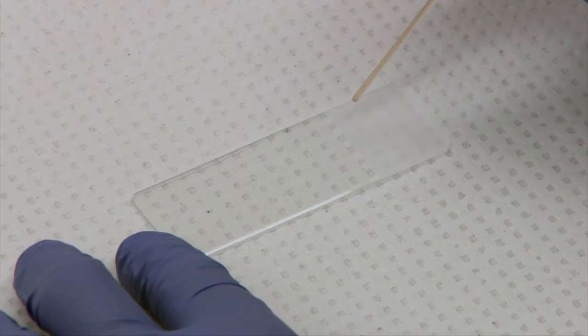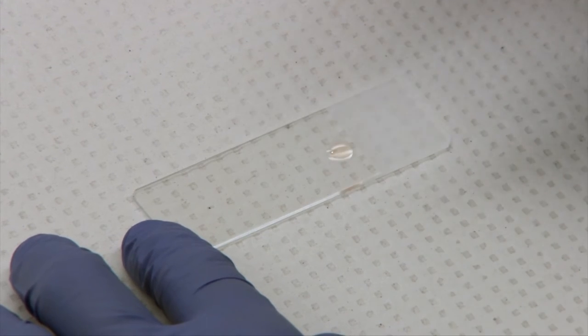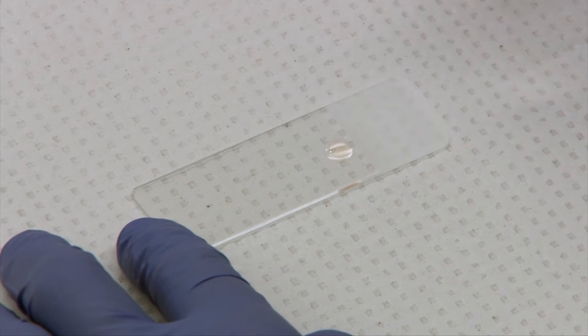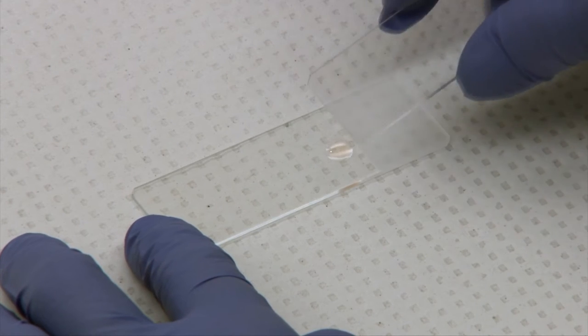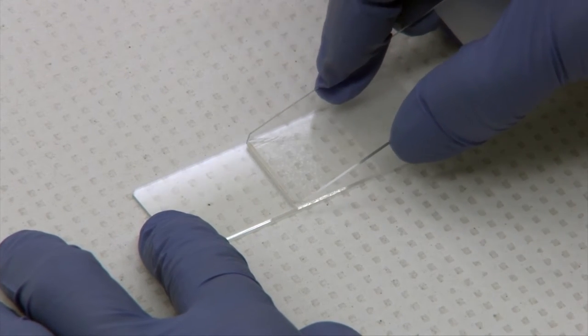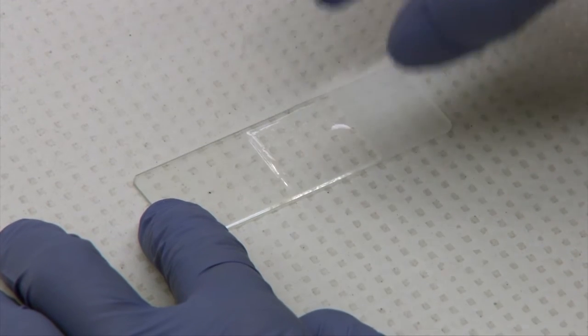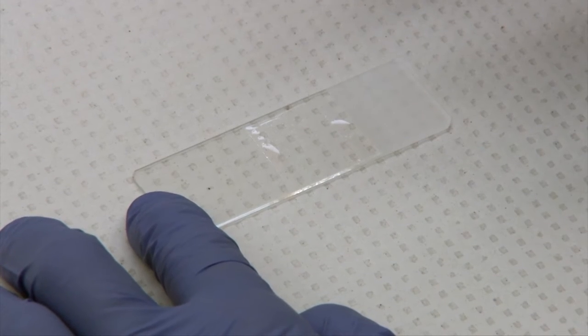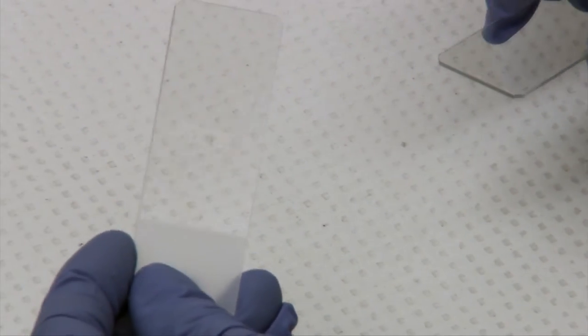And then you will make a line preparation. So this is demonstrating the line preparation which can be used to concentrate cells. And you start out like a blood smear and you just lift it straight up after going about halfway down your slide. And then you will see that you have a line.